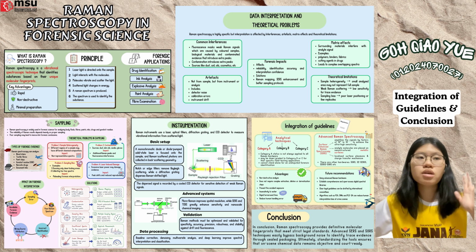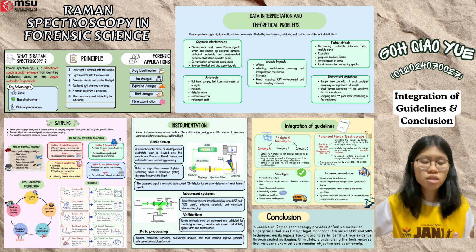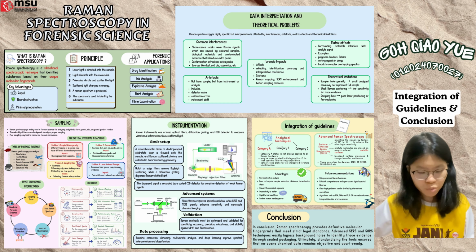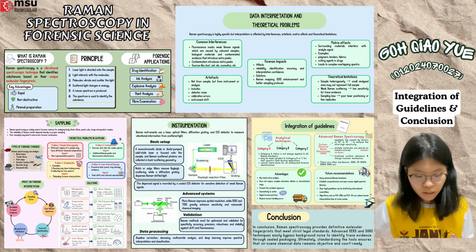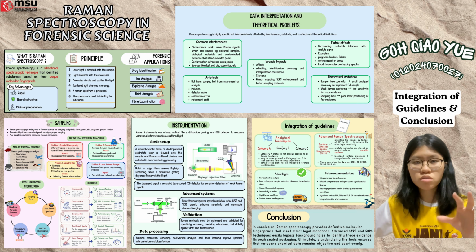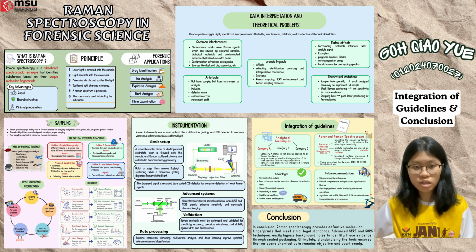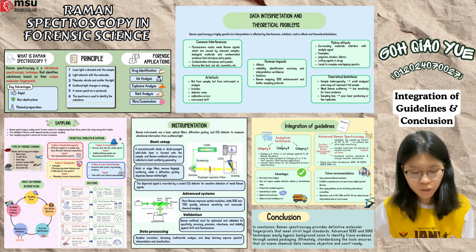Last but not least, my future recommendations are for the utility of Raman hardware. First of all, a standardizing body can establish a quality protocol for SERS substrates to produce a highly uniform and stable nanoparticle array to eliminate spectral variability. Secondly, hardware developers can combine the different Raman hardware together into one unit, for example, SERS with SORS or SERDS, so it can improve the utility and advancement of Raman hardware.